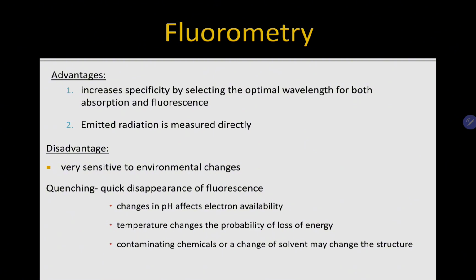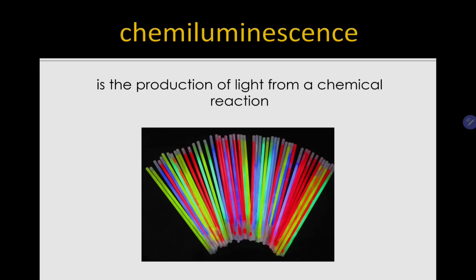Okay? So, let's take a look at the third one. We already talked about the fluorescence, phosphorescence. And now, let's talk about the chemiluminescence, okay? So when we say chemiluminescence, guys, it is the production of light from a certain reaction. Okay? Yung kanina yung nabanggit ko regarding sa phosphorescence natin guys na mga glow stick, that is yung sa watch, that is valid po yun, tama po yung sa watch, but yung sa glow stick guys, my bad. Under chemiluminescence yun siya. Kasi ano na pala ngayon ang mga glow stick natin eh. Man-made pala siya.